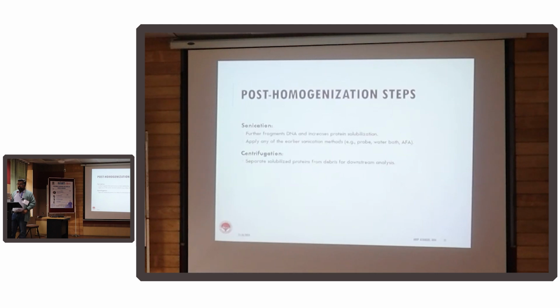broken down. Sonication also helps in that it fragments the DNA. All the DNA is completely fragmented, and for protein solubilization, suppose you're working on histone proteins, now the protein part is completely intact, but the DNA that was bound to histone is broken down, so that helps.